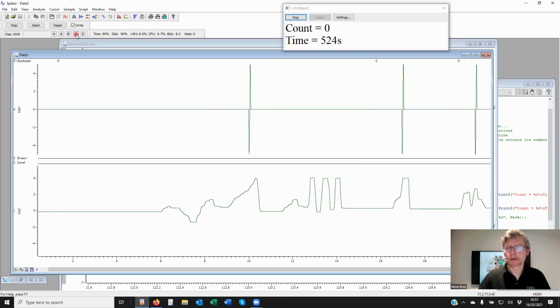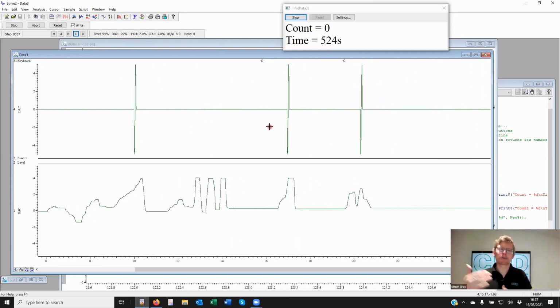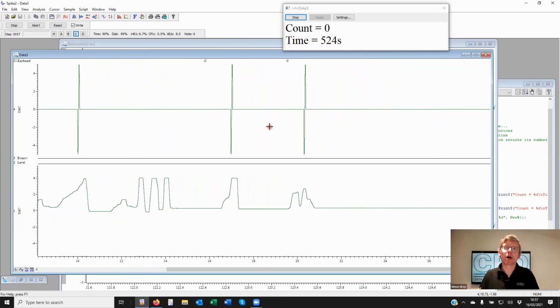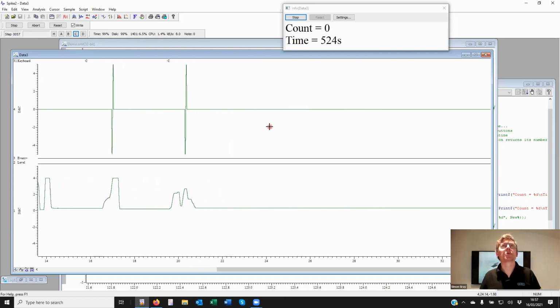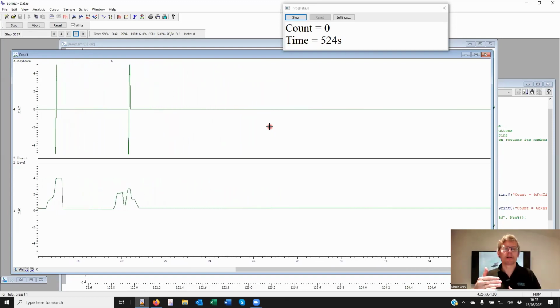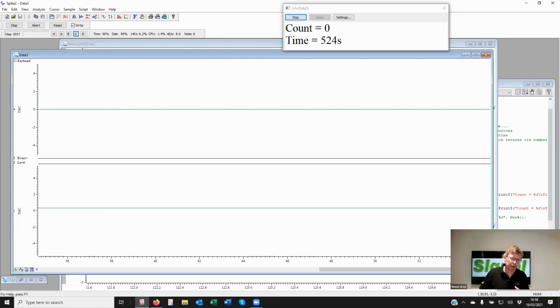Okay. So the same applies if we're going to set two thresholds, so the waveform has to be outside or within, and we can combine some of this as well. So that you might want to detect when you're outside of levels, and then start searching for a peak, for example. It's certainly easier with a text sequencer, but items like that could be programmed in to the graphical sequencer.